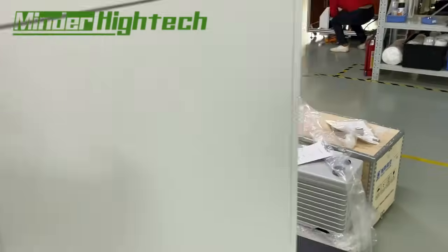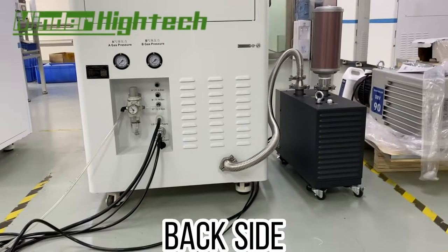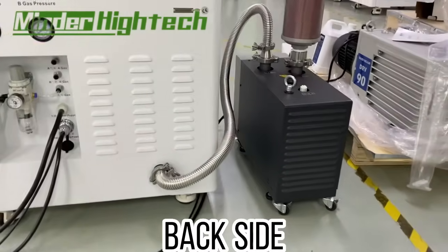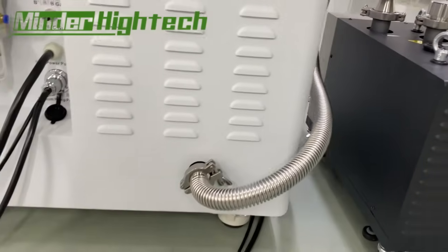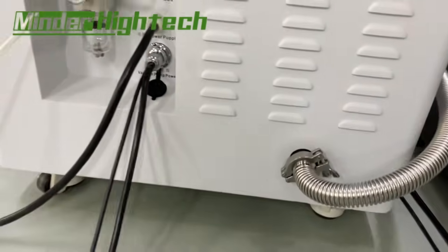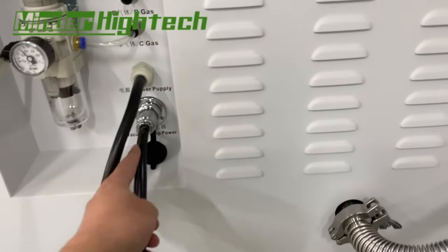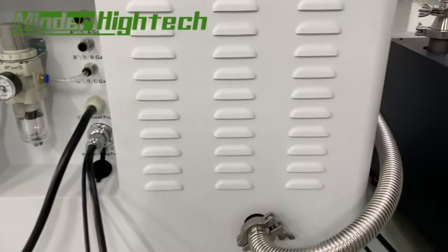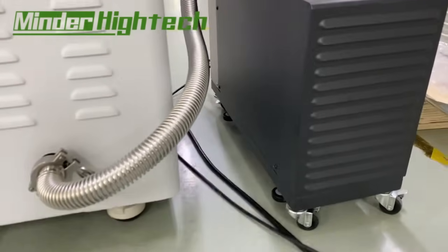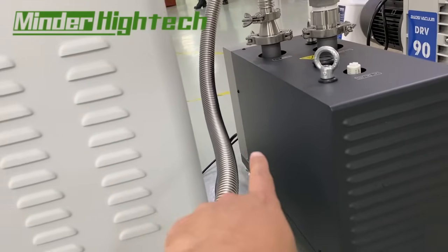Let's see the back side. This is the connection for the vacuum pipe, and these two cables are for the pump power supply — they are connected here.